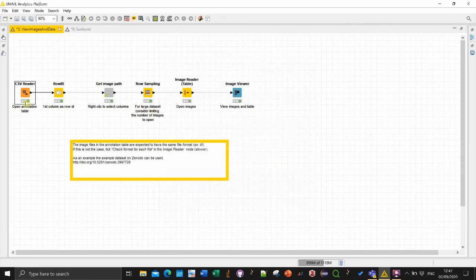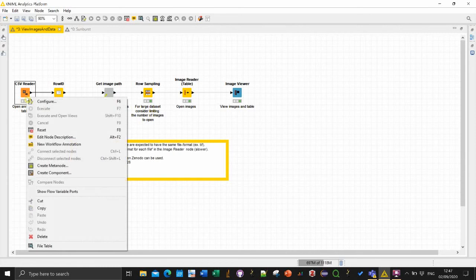Then in your case it should turn yellow, this kind of traffic light. And then you can do execute and open views or just execute.